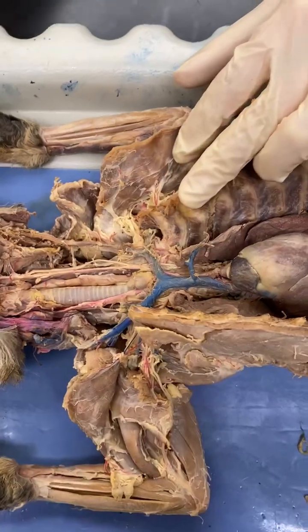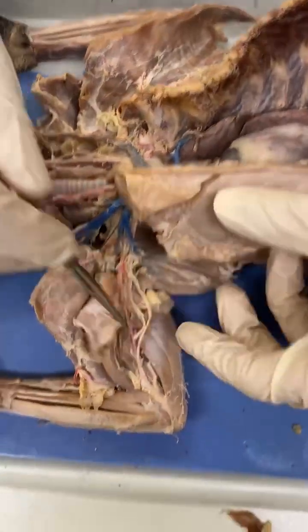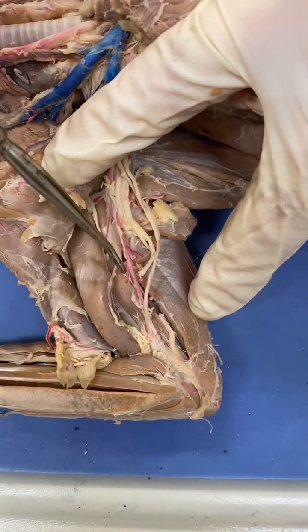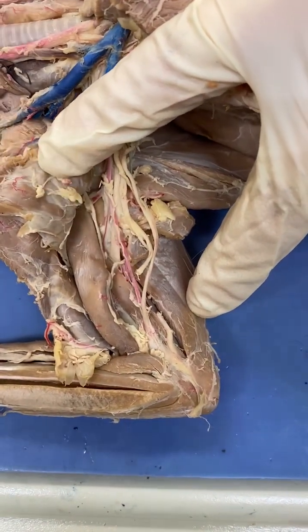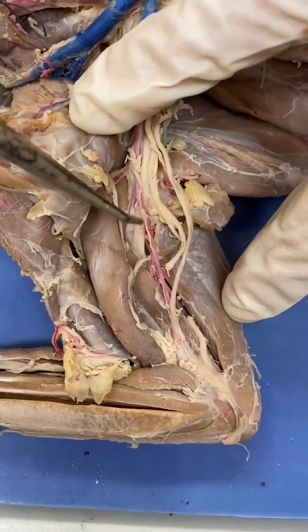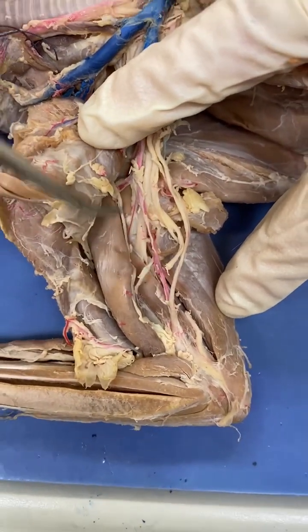The brachial artery. It's kind of nestled in under the biceps brachii. And vein if you have it. There's no good vein on this one, but it would be around this area.